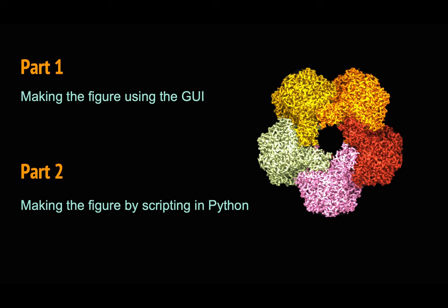Nowadays, Coot can be imported as a module in Python 3, so I will show you all the Coot functions in Python to make the figure.